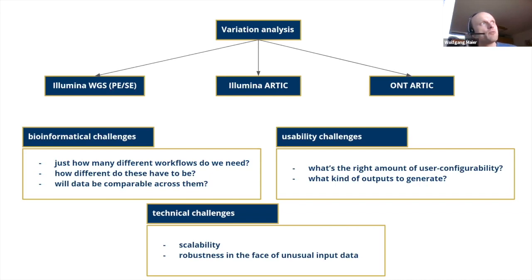So what does a user really want? You can, of course, produce just consensus genomes, like publicly available through GISAID, but then you're throwing away a lot of the data that you actually generated, because a consensus sequence is really just the most frequent variants that you're really sure about, while there may be many more sub-threshold intra-host variants, as we call them. So things that are going on inside one infected person where the virus continues to evolve. And you might throw away much of this information by just looking at a consensus genome. But how then to report this more complex true picture?